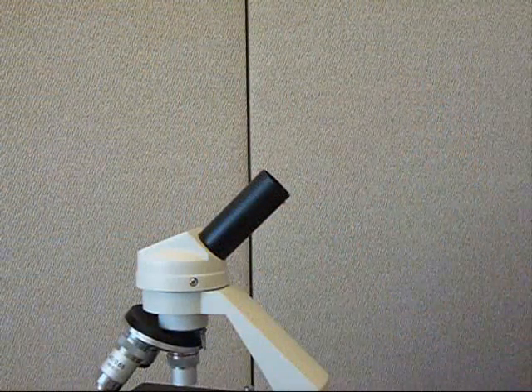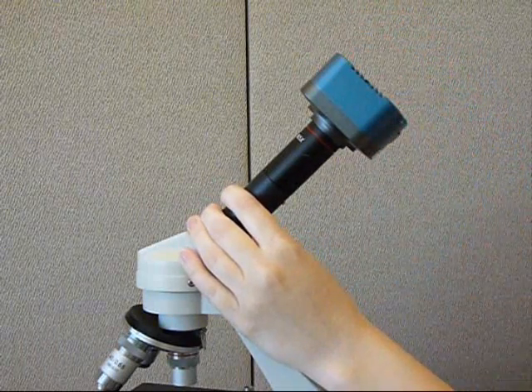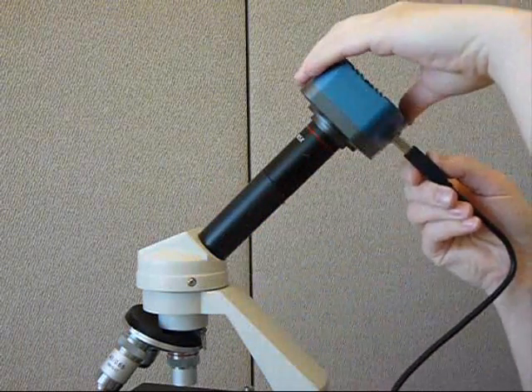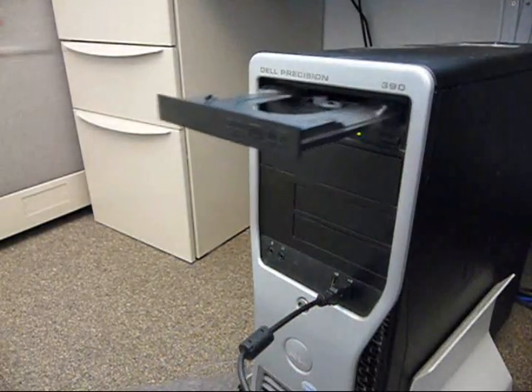Assembly is easy. Simply loosen the set screw to remove the eyepiece from your microscope and insert the camera eyepiece in its place. Connect the camera to a USB 2 port on your computer, load the software, and you can start taking pictures.